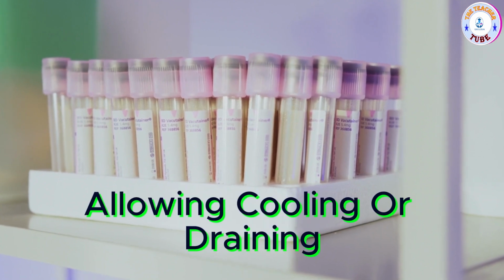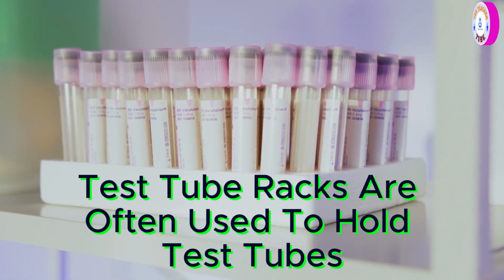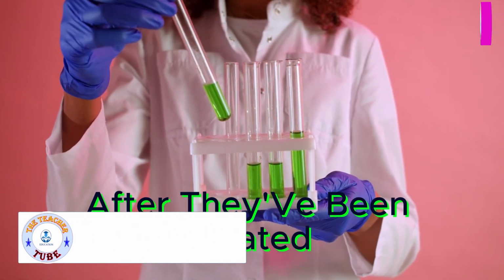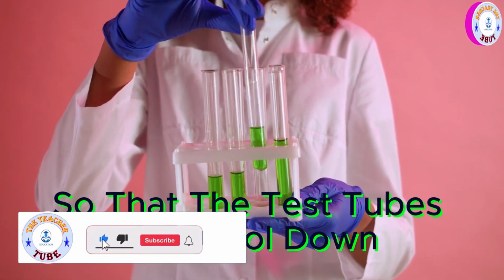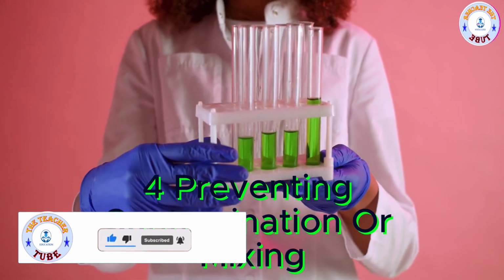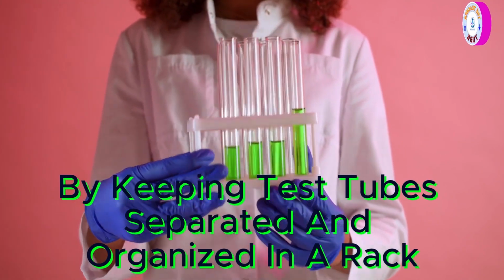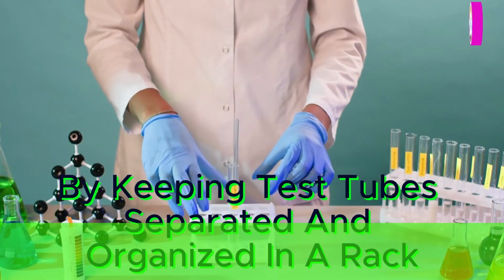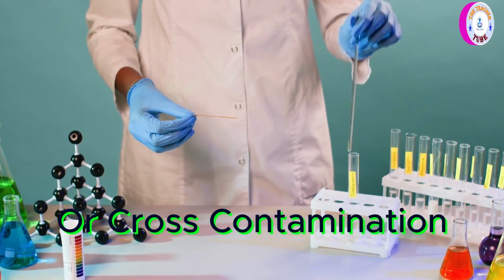3. Allowing cooling or draining. Test tube racks are often used to hold test tubes after they've been heated or contain wet substances so that the test tubes can cool down or drain without making a mess. 4. Preventing contamination or mixing. By keeping test tubes separated and organized in a rack, it prevents unwanted mixing of substances or cross-contamination.